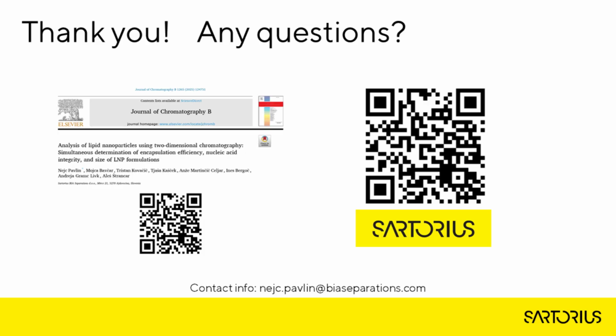Yeah, very good question. It was quite hard to find an explanation of what is really going on on the SDVB column when the particles are loaded. We think that at least two different processes are simultaneously happening when particles are bound on the SDVB column.